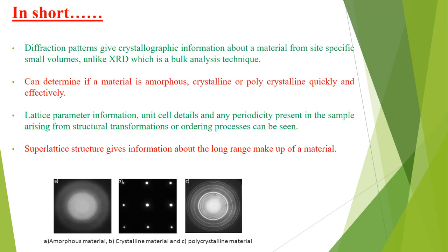Lattice parameter information, unit cell detail, and any periodicity present in the sample arising from structural transformation or ordering processes can be seen. Superlattice structure gives information about the long-range makeup of a material.